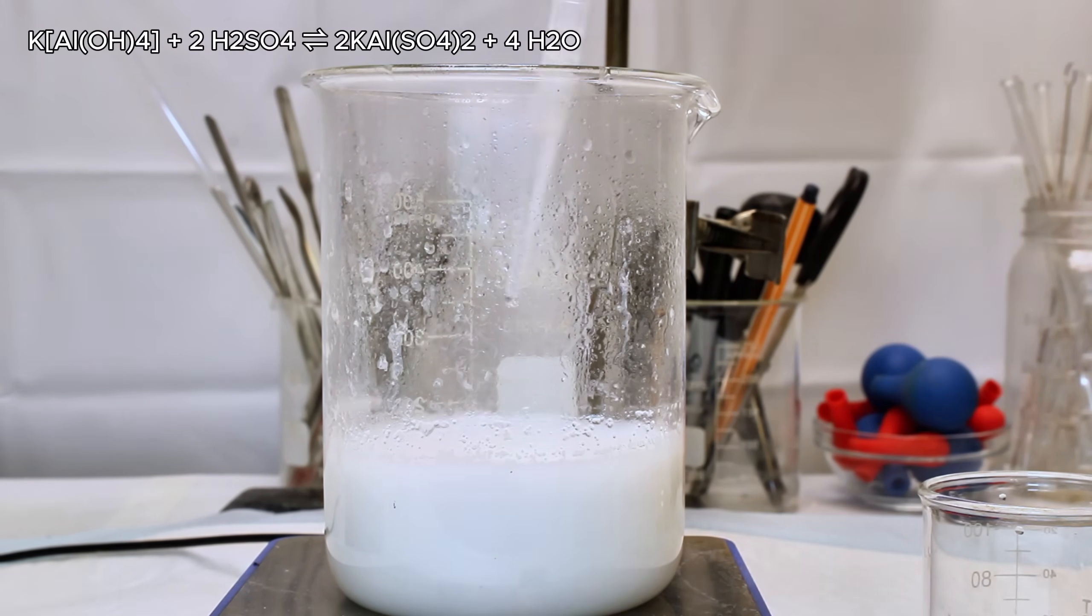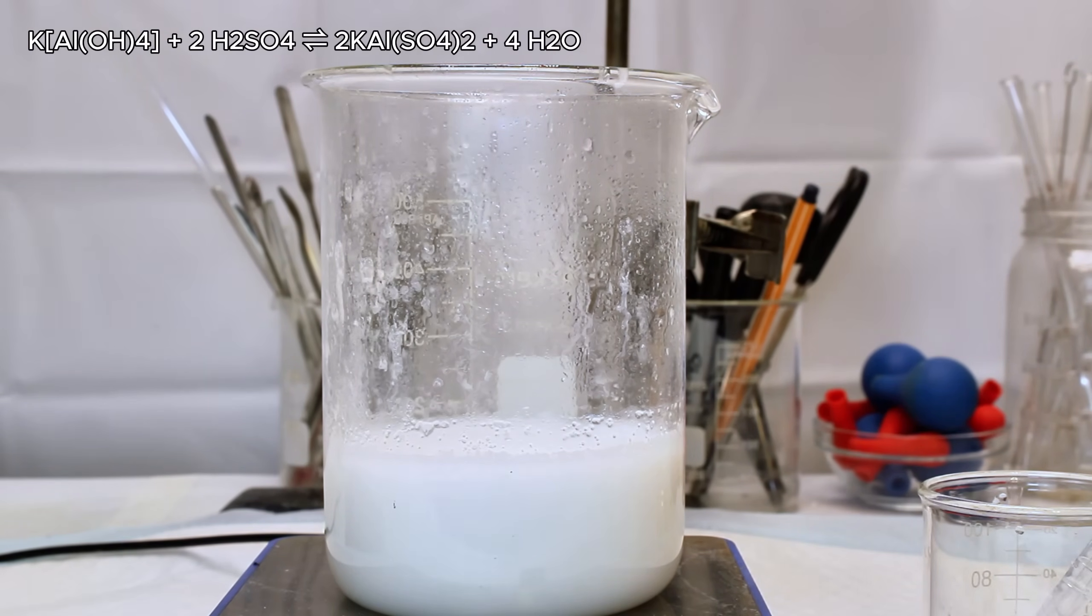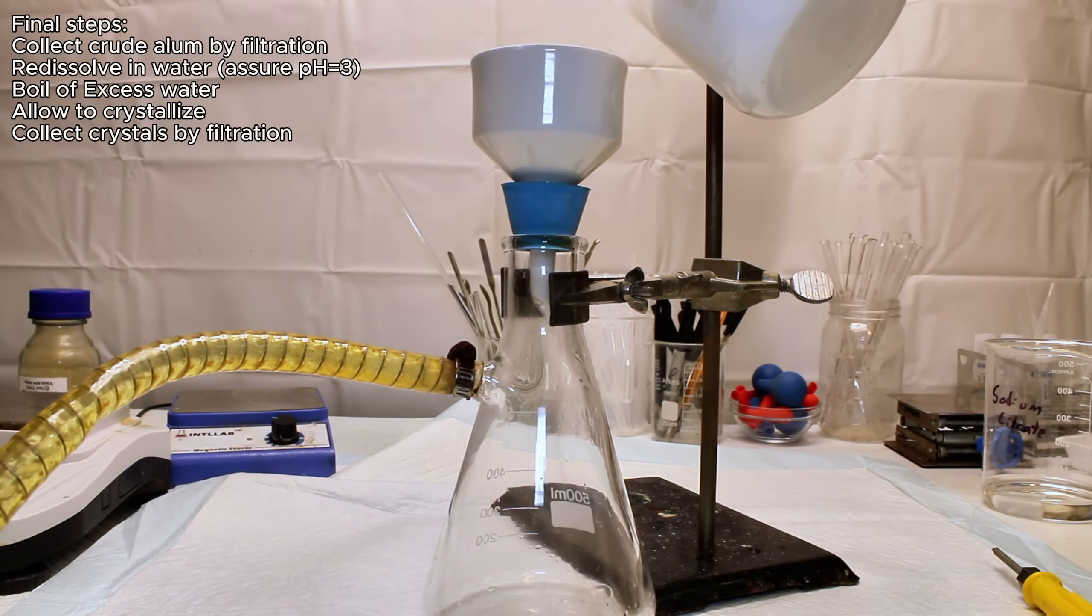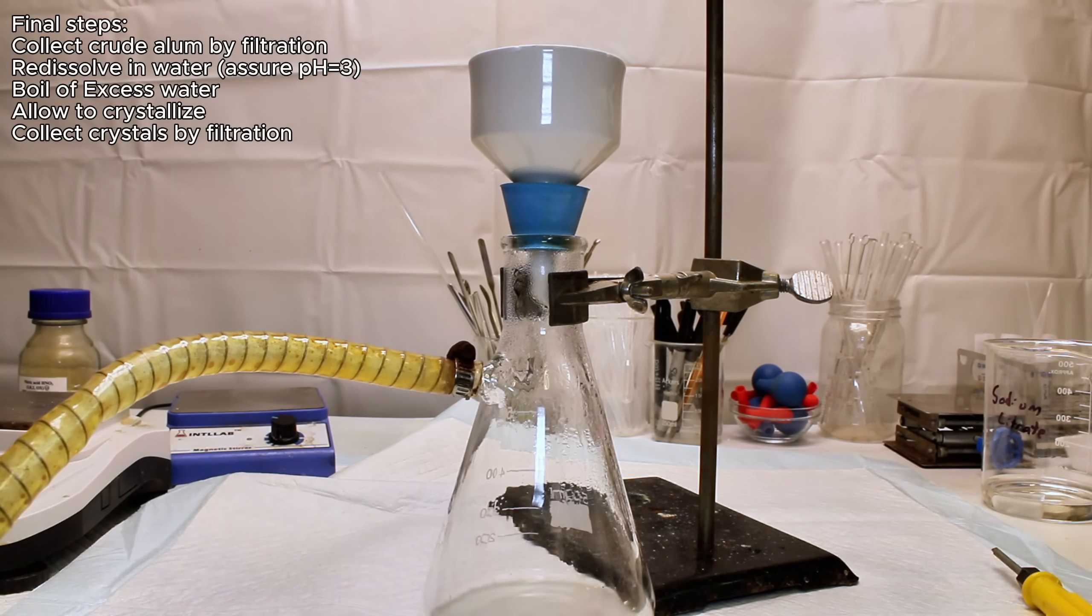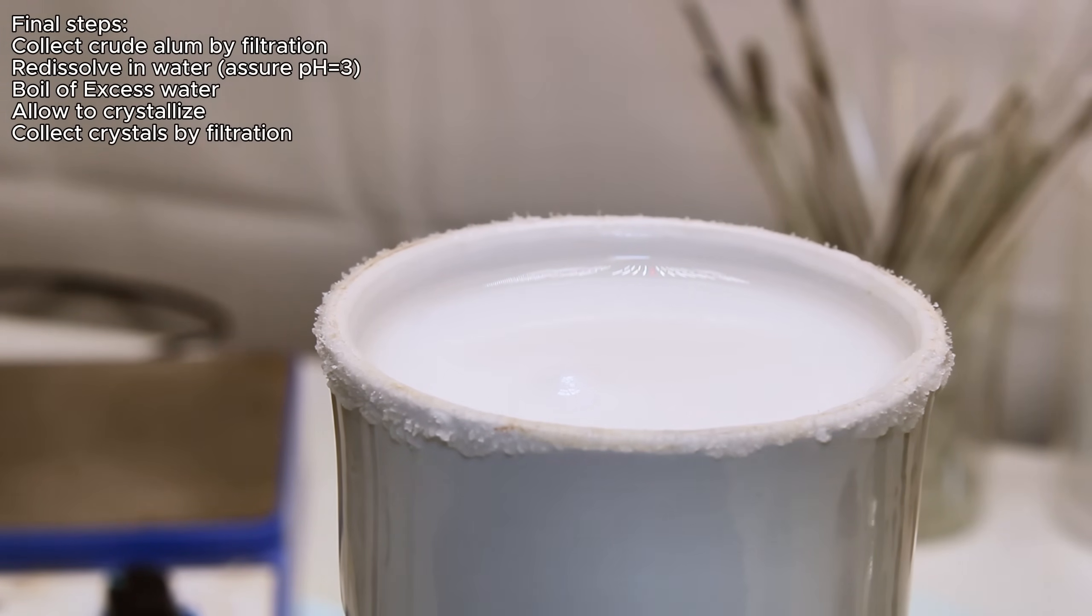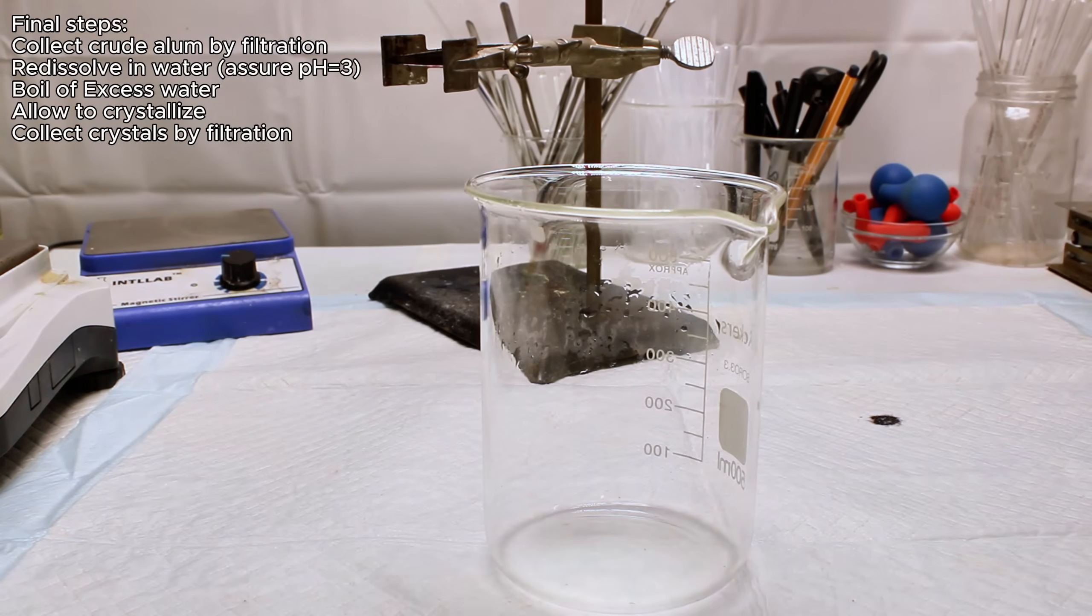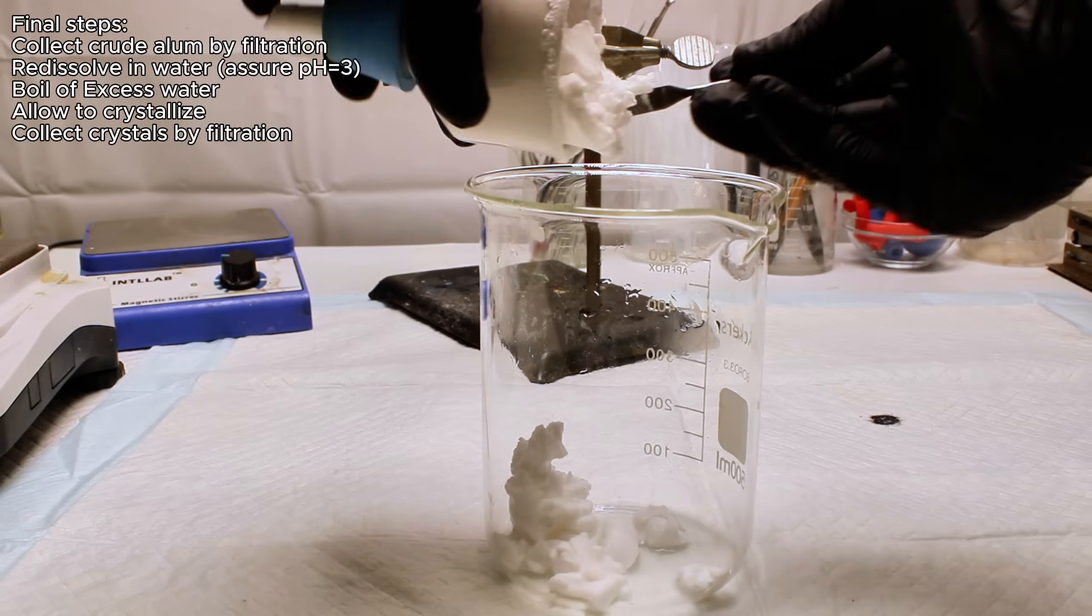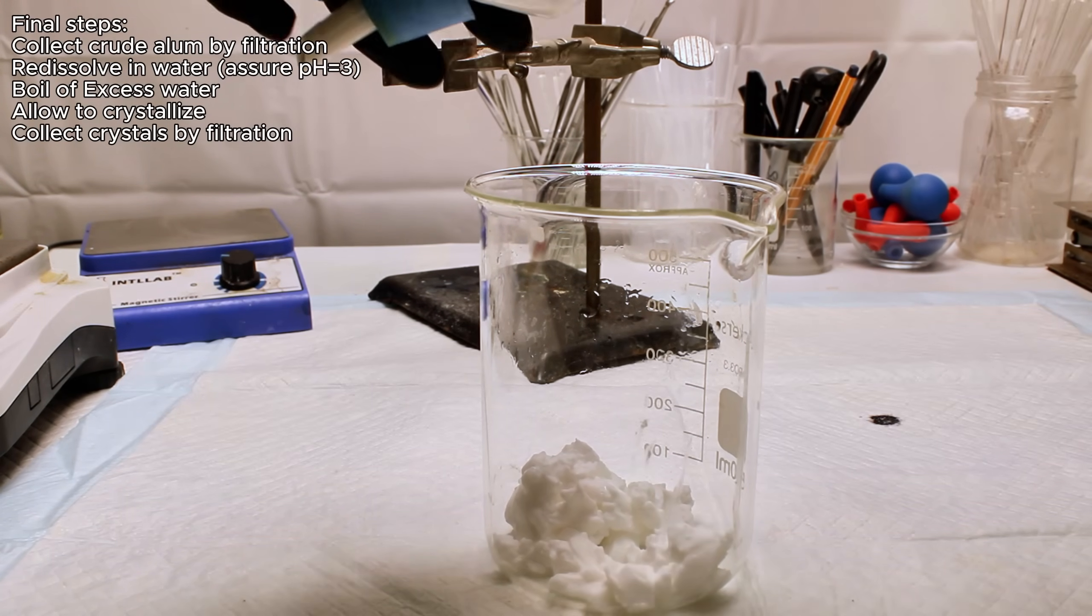And as a side note, if you use a larger volume of water than I did here, this step may result in the white precipitate redissolving. I went ahead and filtered my crude alum to remove any leftover impurities from the aluminum foil, transferred it to a beaker, and then added boiling water until it completely dissolved. I then balanced the pH back down to 3 with a bit of sulfuric acid before boiling off as much excess water as possible.